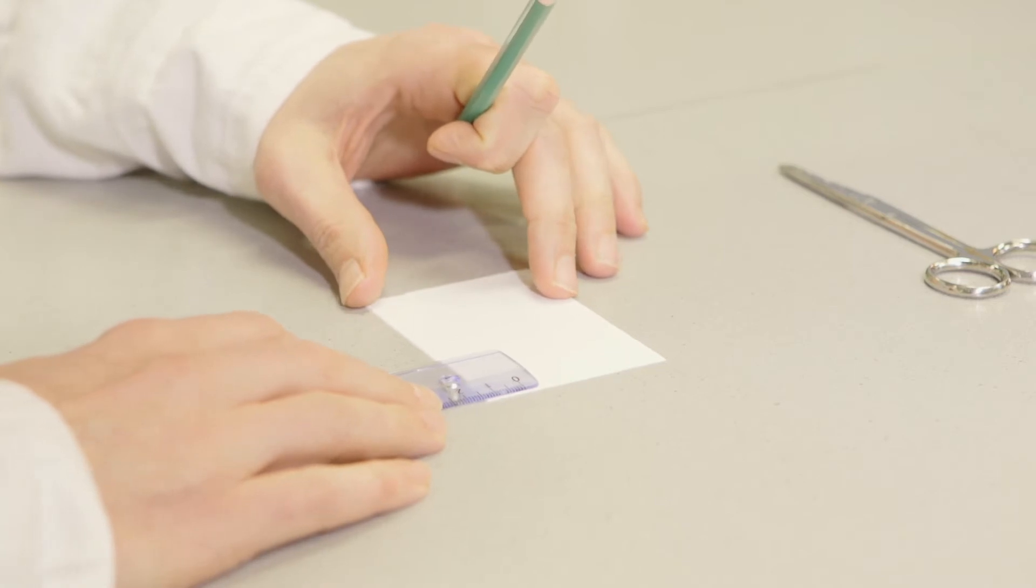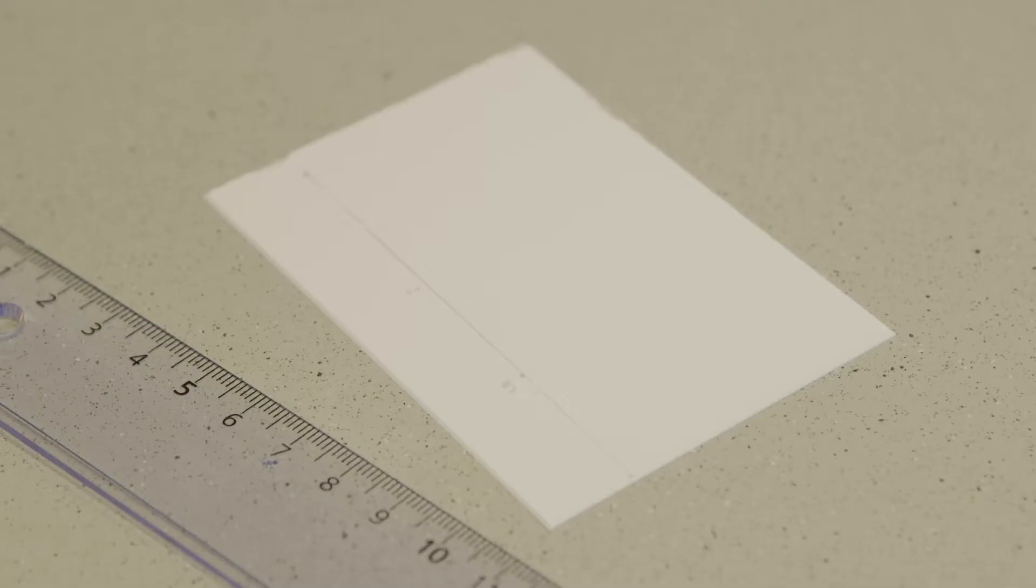A very thin line is drawn on the TLC plate 1.5 cm from the bottom edge with a soft pencil. The layer must not be damaged.